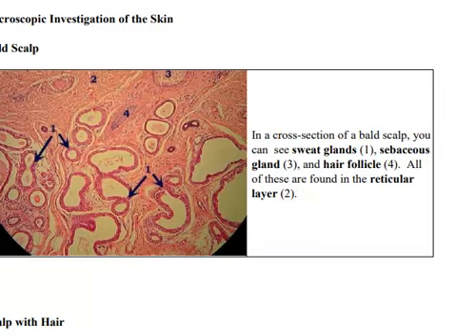You're really going to have to look closely at this microscope slide to figure out what's going on in this particular picture. So each of these things that is round like this, if you look carefully, you'll see that these are actually cuboidal epithelial cells. They're cuboidal cells, and these make up the sweat glands.